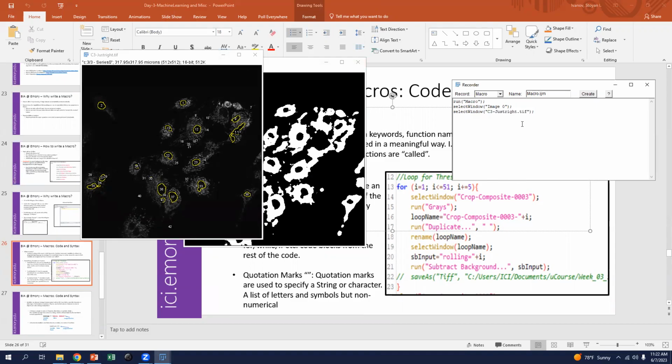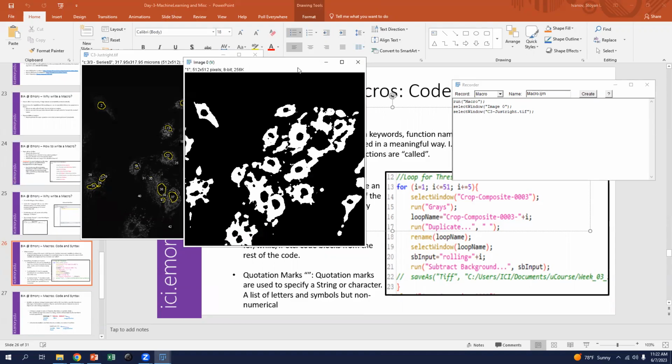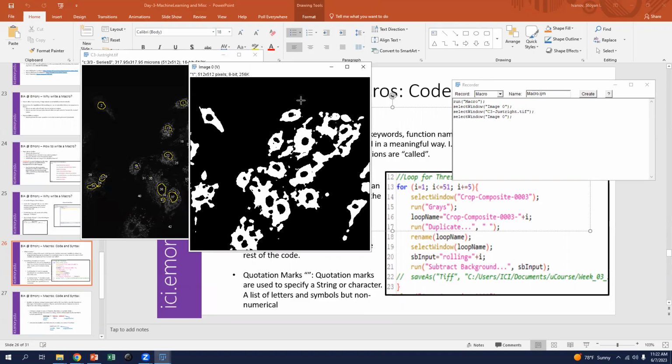And this is going to be useful in the end because once we perform an analysis pipeline, we directly have a basis for the macro because we can then pull it into the text editor and start changing it to generalize it or to make it behave more specifically if we need that.